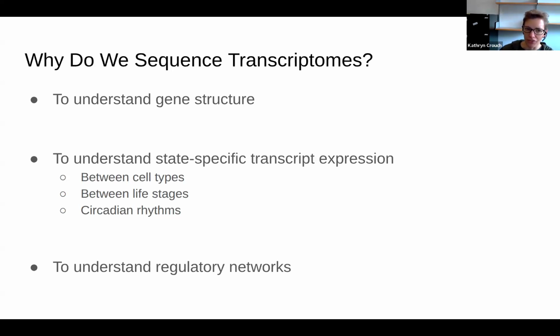When I ask my MSc students this, they usually come out with ideas which are in this second bullet point. So they might talk about understanding what's different between different cell types, between different life stages, over a time course, or if you grow your organism in different media, at different temperatures, or in slightly different environments. The second bullet point is what we generically call differential expression. Basically, the idea of asking, if I change something, how does the transcription change in my system?